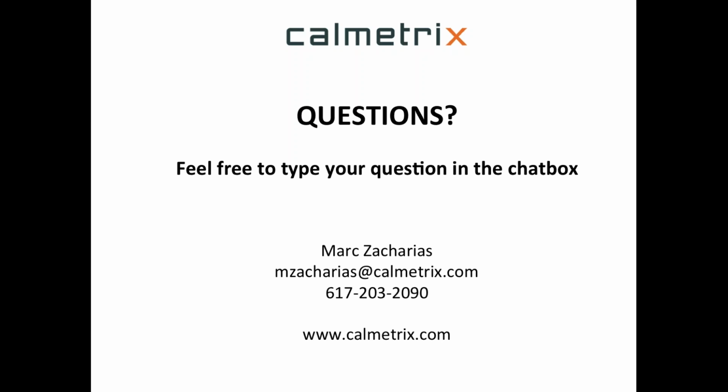The other question that came up here is Jeremy is asking, how much does an 8-channel model typically cost? Jeremy, the systems range on the low end from around $22,000, and an 8-channel is typically up in the low 40s for the HPC models. The mixers themselves are additional options that can be added per channel, and those are about $1,800 per mixer, with discounts available for purchasing 4 or more. So that's the range that we're talking about.